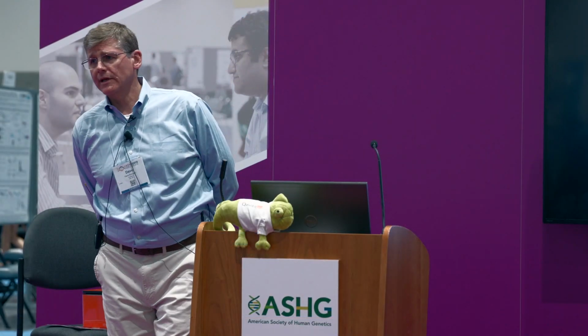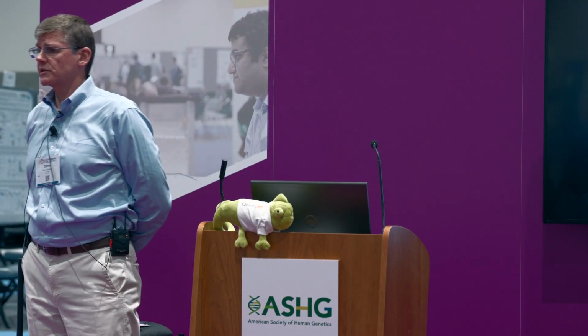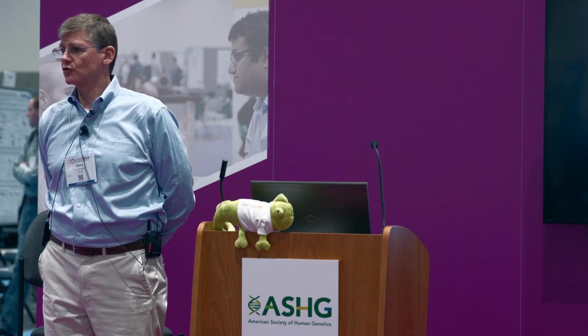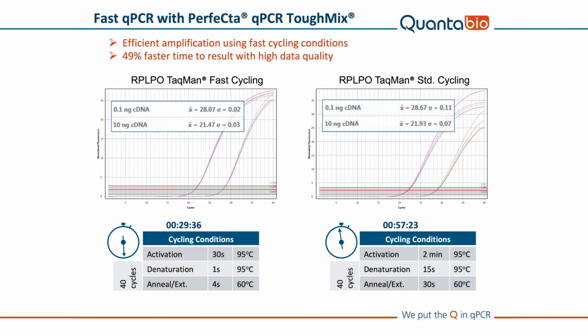Again, another application just using an off-the-shelf assay. This is just a typical TaqMan endogenous control, available from Applied Biosystems for RPLP0. And you can see that if we use the standard cycle times, taking about an hour for a run to complete, we can cut that almost in half with absolutely no loss of data integrity or precision in the assay.